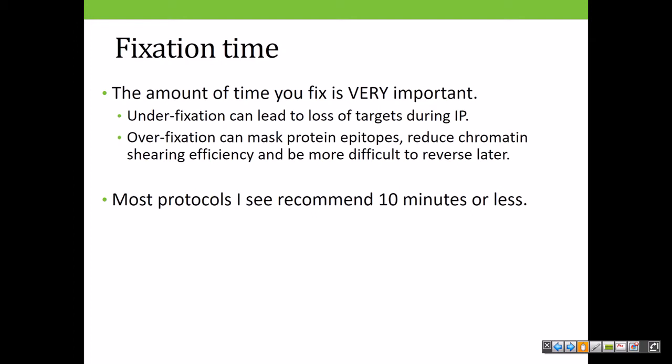I will point out that the 10 minutes, or whatever number you pick, is a very strict time point. This is not a very flexible time point. I set my timer for 9 minutes and 10 minutes. At 9 minutes, I'm walking over. I've got everything ready to go because the next step is to add my glycine, which is going to quench the reaction. It's going to basically soak up all that free paraformaldehyde and stop the fixation process from continuing. Okay, so you set your timer. You follow it exactly. If you're late, write it in your notebook, just in case, but just note it because this is a very strict time point.